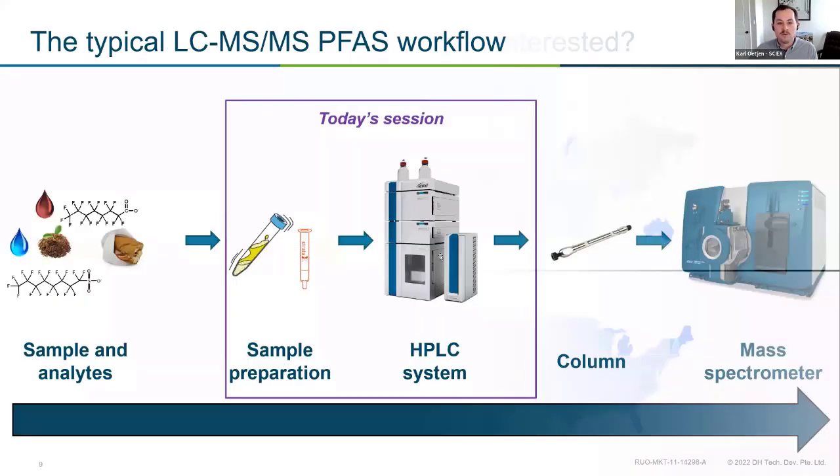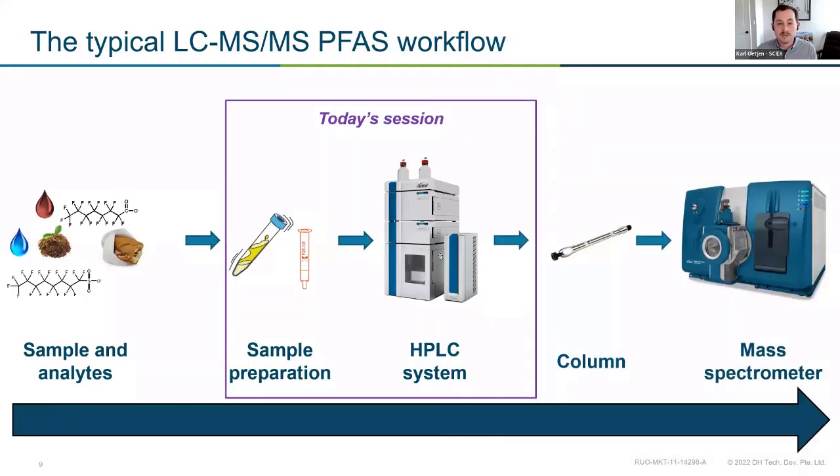So with that, what we're going to really talk about today would be the sample prep portion. Sam is really our sample prep expert, or one of our sample prep experts, and he's going to dive into some of the approaches that you can use for different matrices, because there are a ton of different matrices. And I will really be talking about the HPLC system, and not so much chromatography, but how to get your HPLC system ready for PFAS analysis, and what are the main sources of contamination, things to watch out for when you're doing this type of work. And with that, I'll go ahead and hand this off to Sam.